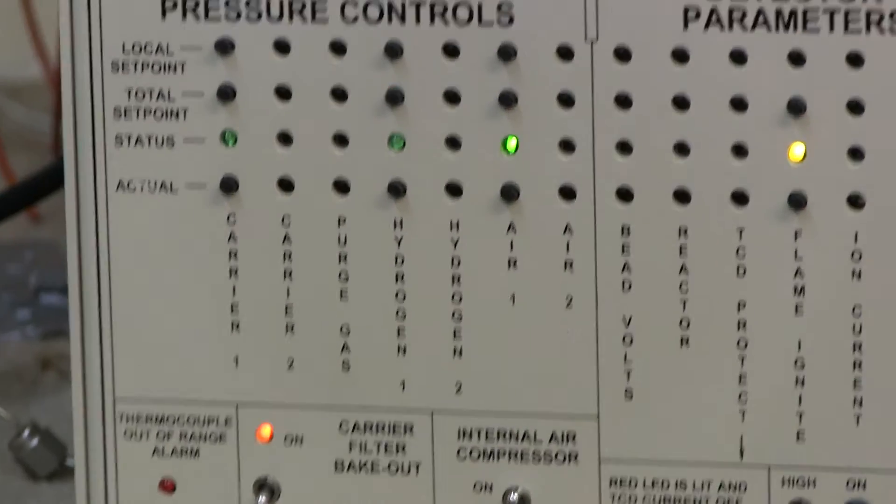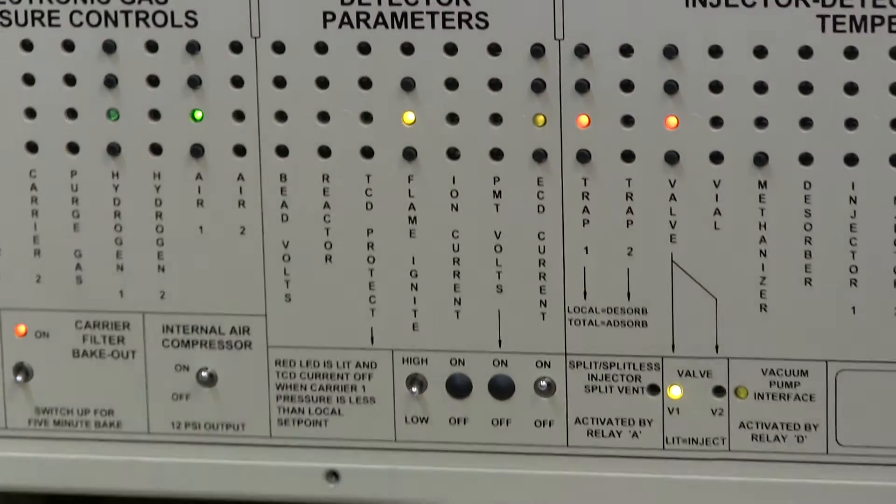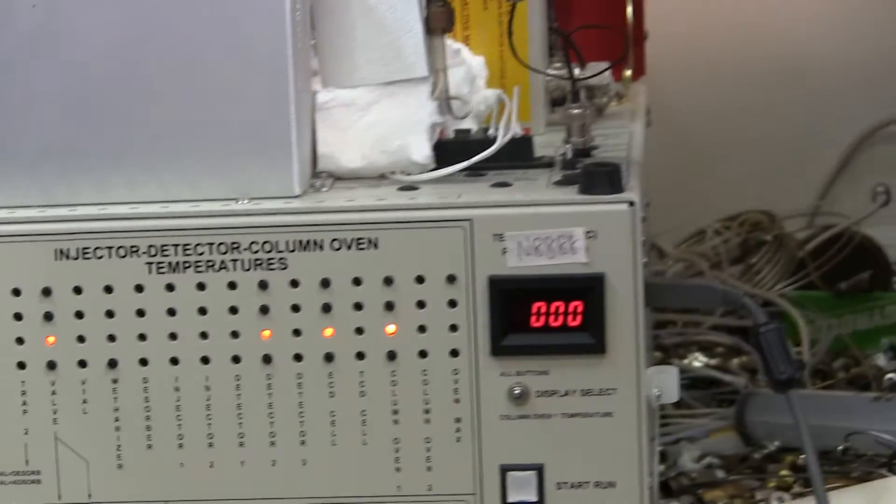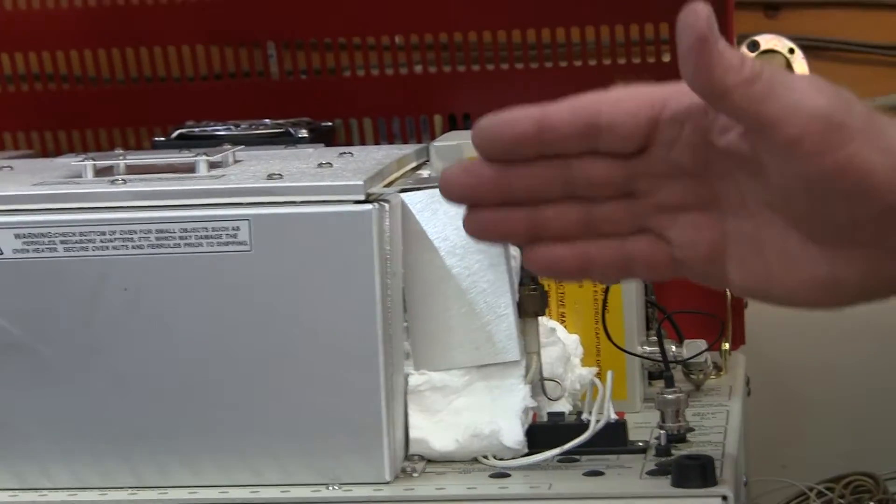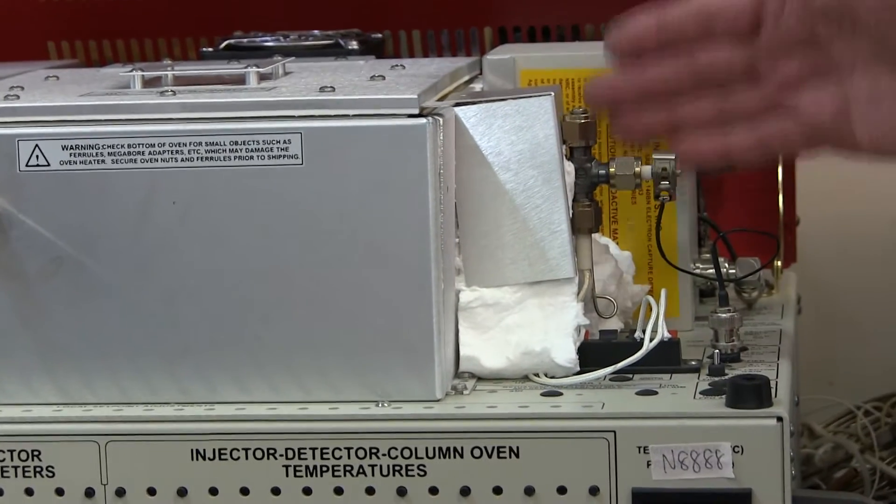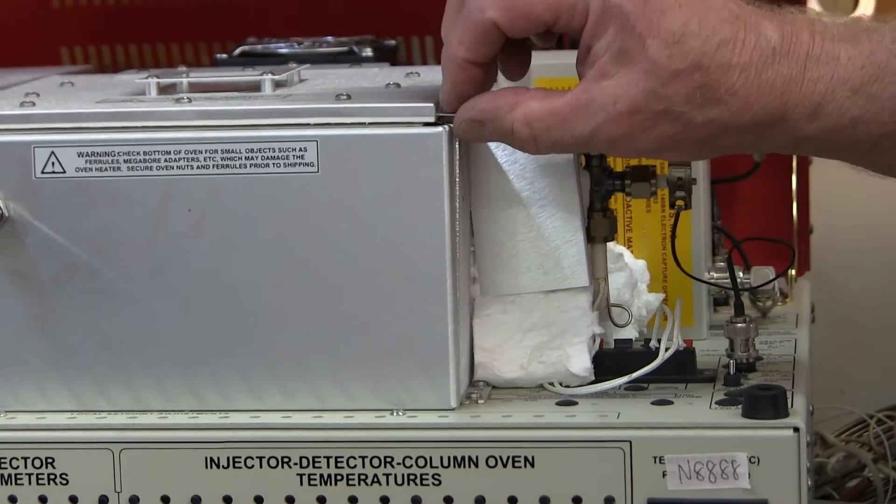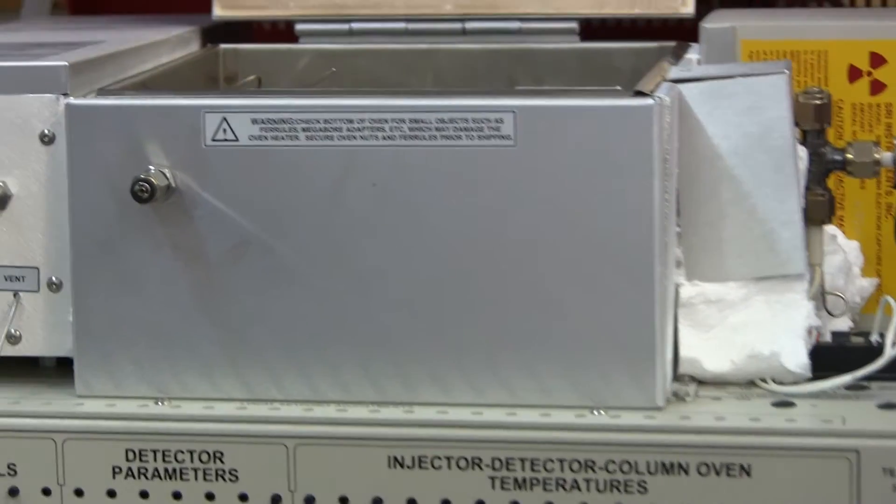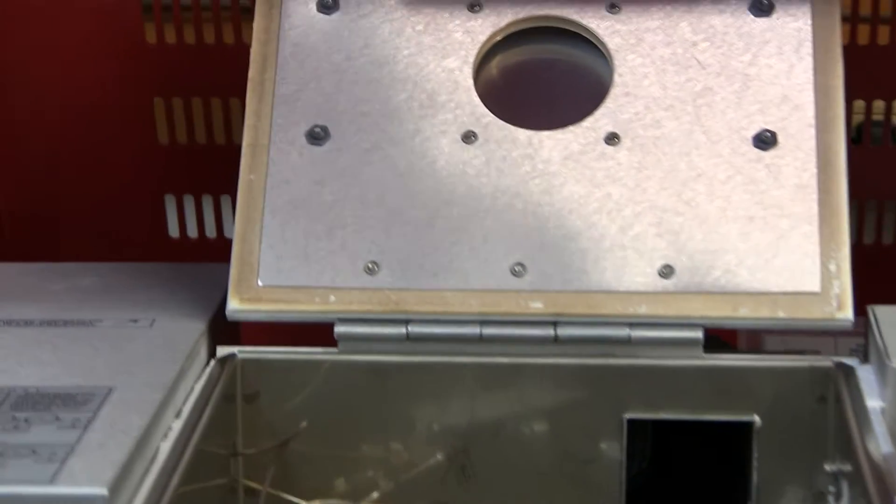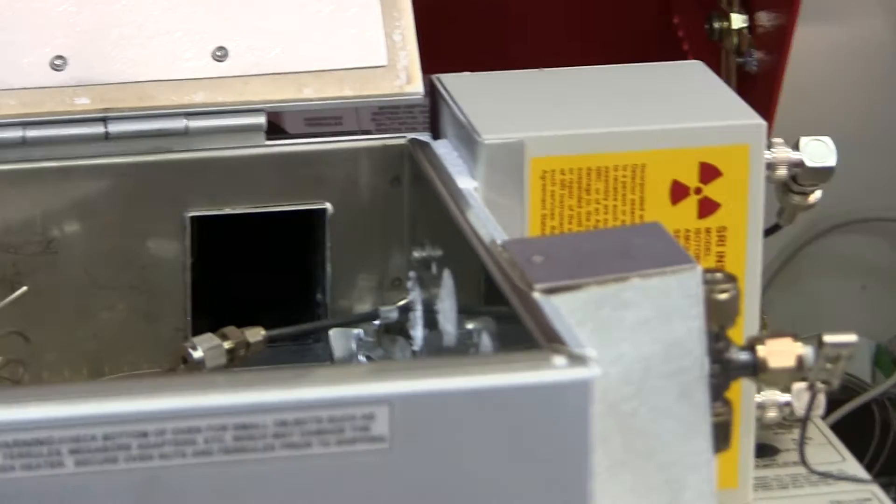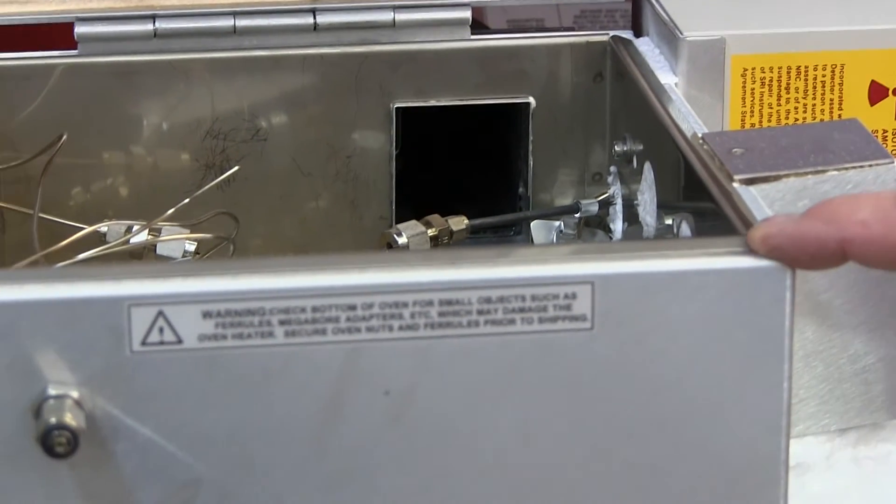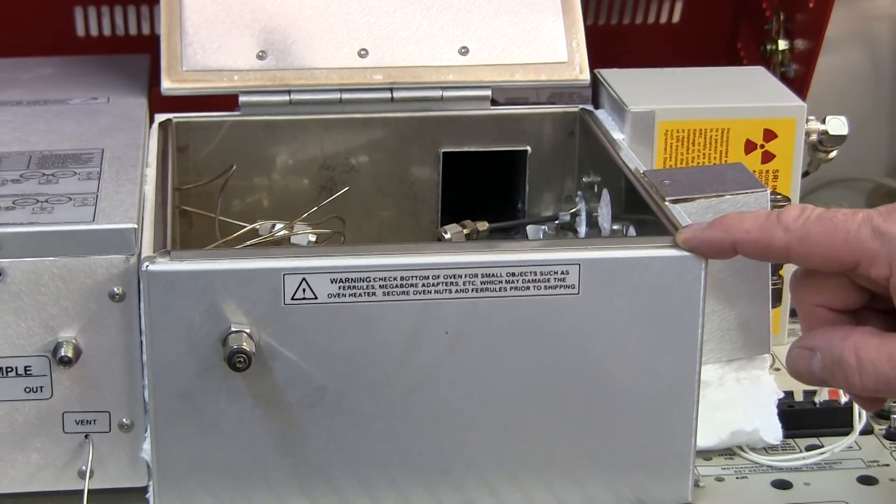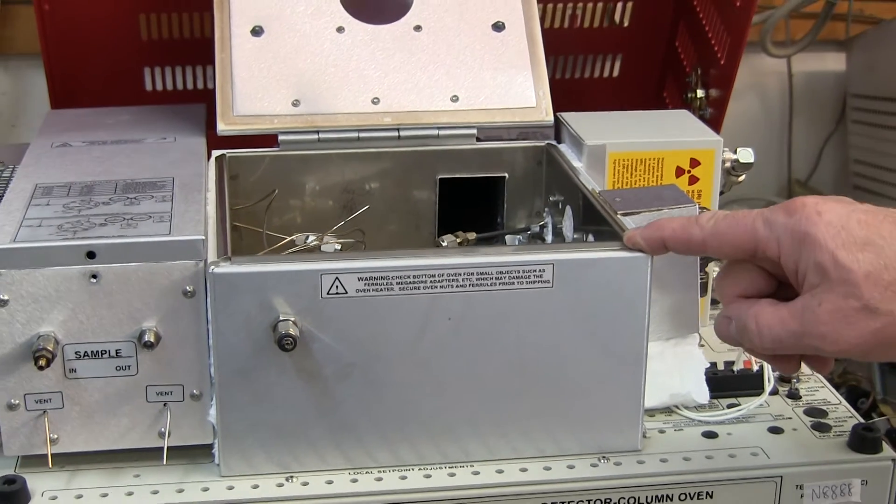So that's the front panel of the GC. Over here on the right of the GC is where we mount the detectors. You can have up to six detectors mounted in these positions along the right-hand side of the column oven.